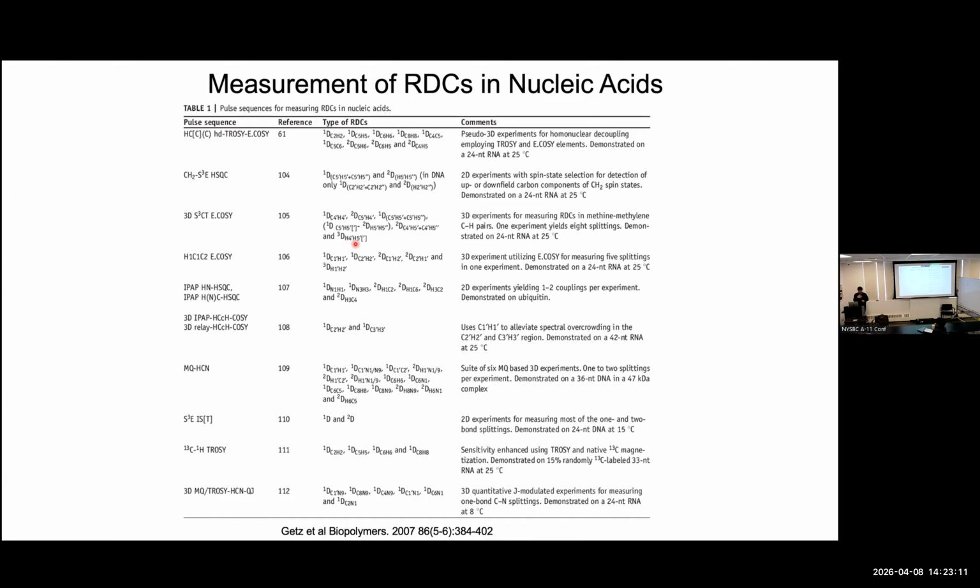Last time in class, I think we ended up veering here, and I started talking about pulse sequence development. Let's not do that. But any ideas about how the chemical shift evolves, not freely, but so that the scalar coupling evolves in a constant time? You can build pulse sequences.